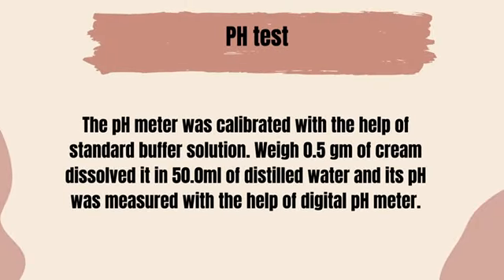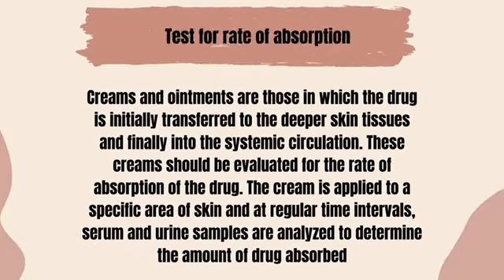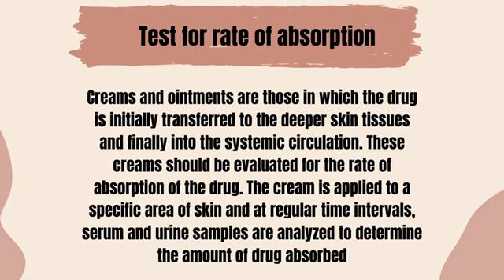pH test. The pH meter was calibrated with the help of a standard buffer solution, when 0.5 gram of cream was dissolved in 50 ml of distilled water, and its pH was measured with the help of a digital pH meter.